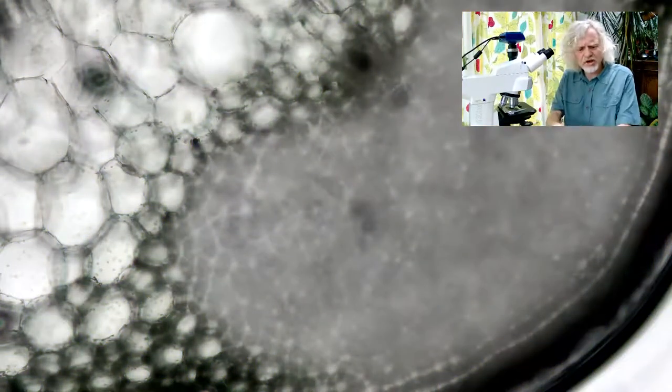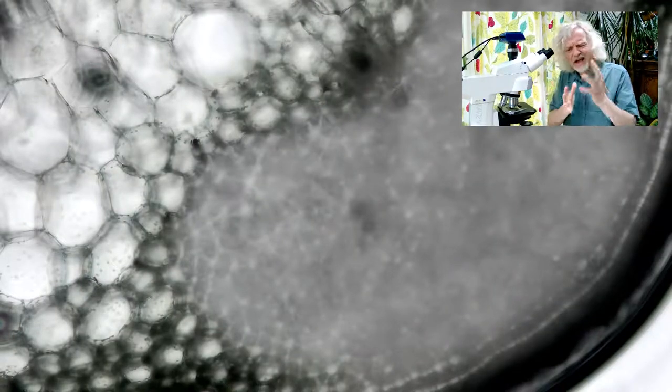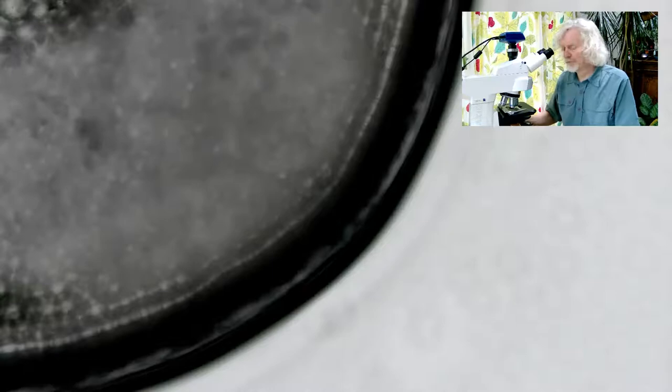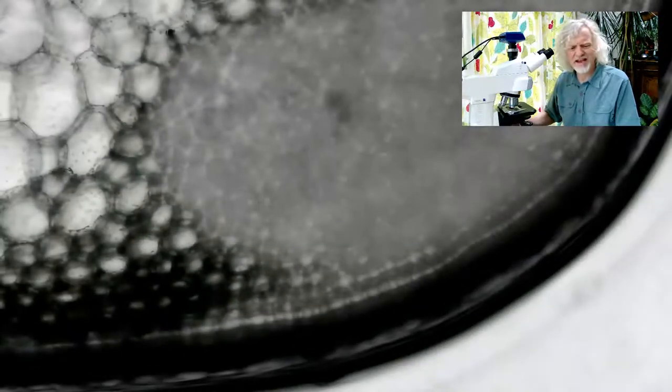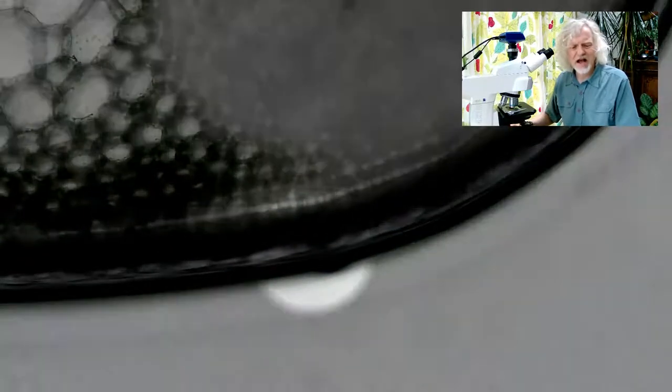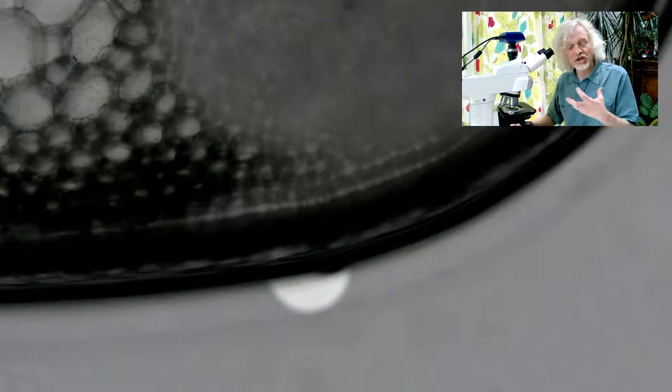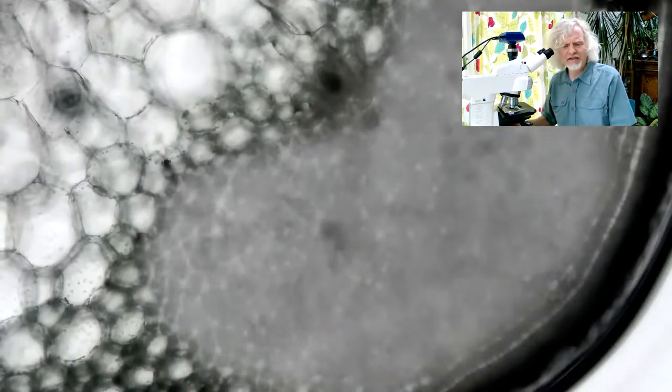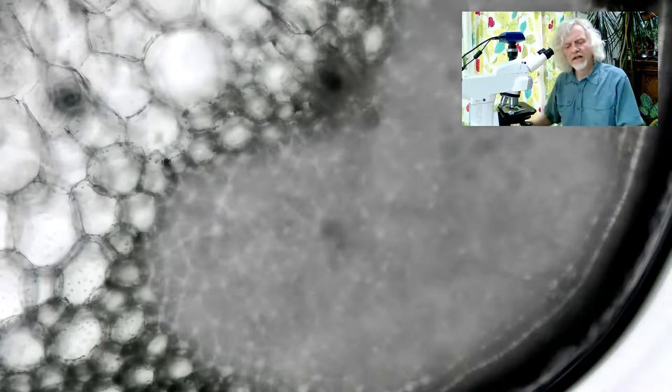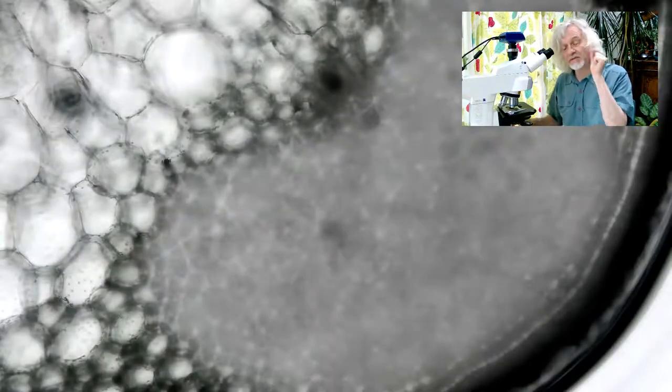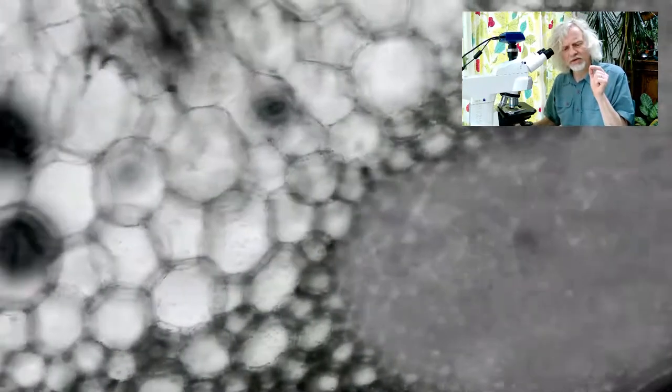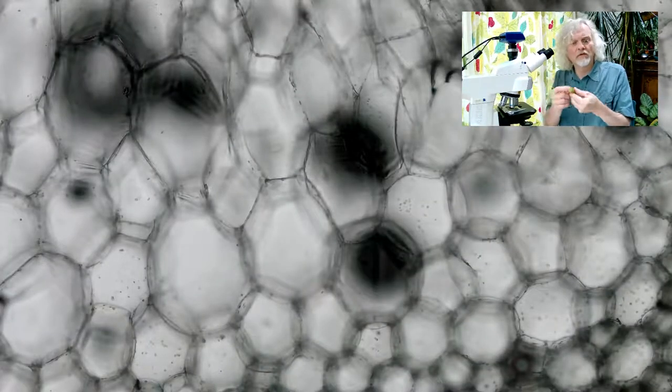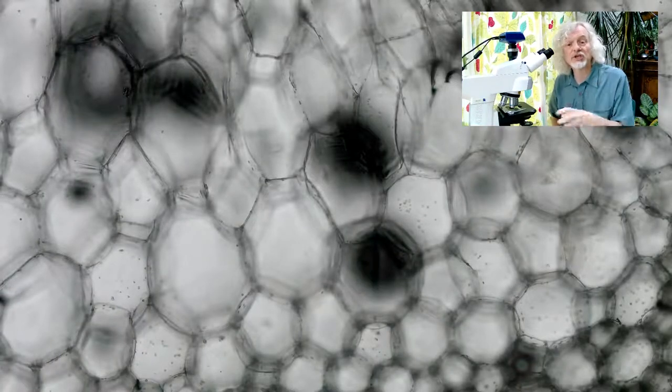Okay. So this is what I wanted to show you kind of just underneath the camera, because it's quite difficult to sort of get your bearings, basically. So what I've got here is my little bit of stem. And what you can see here is this kind of border here, this is the epidermis. So this is the outside edge of the plant. And in theory, it's green, but you can't really see the green. And then this bit, you might think this bit is one of the stringy bits. And it is one of the stringy bits, but it's not the obvious stringy bit. I'll come back to them in a little bit. Because what I want to show you is this stuff here, these are the main cells, the cells that make up the bulk of the celery. And it's a kind of plant tissue called parenchyma.